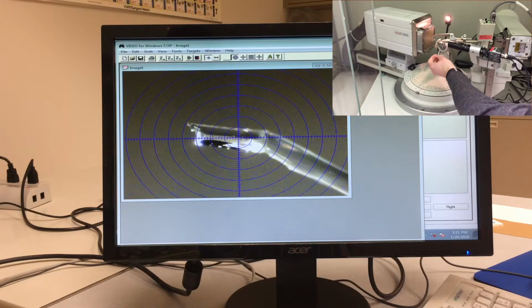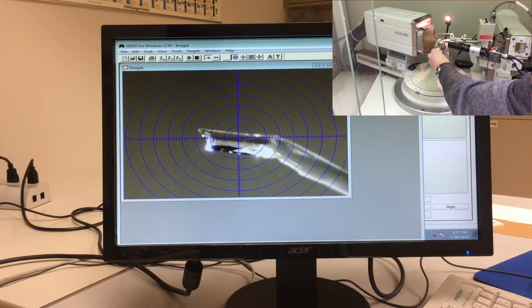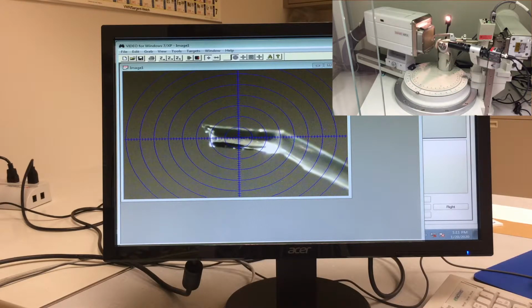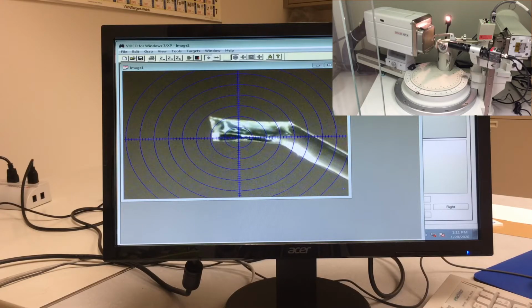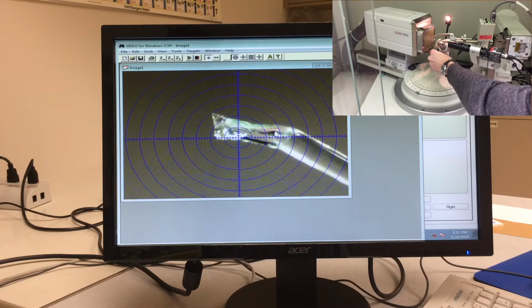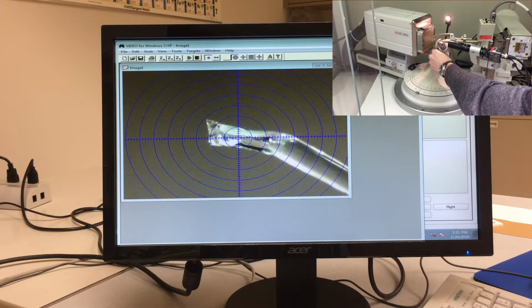So that is sort of orthogonal to the camera direction, which is that black thing. So yeah, now I can make sure that it's about halfway out, so that the middle of the crystal is roughly in the crosshair. Just do a quick adjustment, spin phi, translate that down on the goniometer.